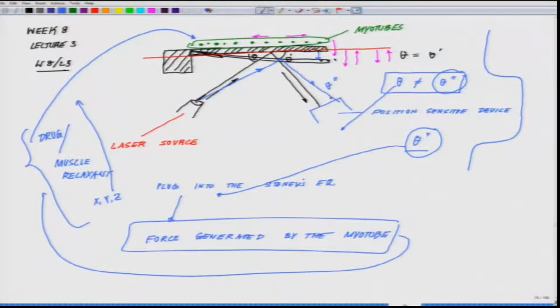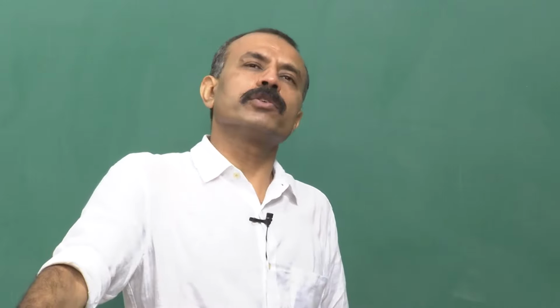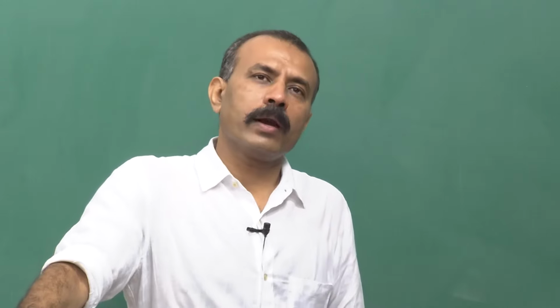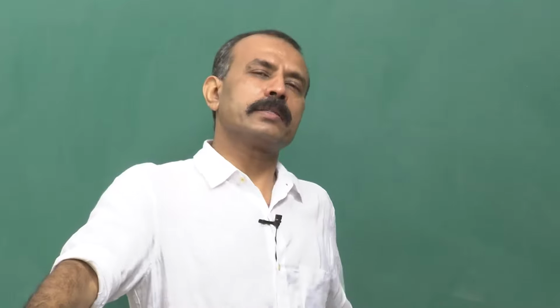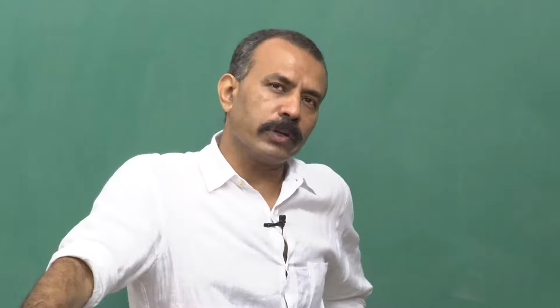So, this is one of the cleanest systems we had the privilege of developing, where we really could show how technology can change the future of in vitro systems, where a micro machine device is being used to measure the contractile force generated by the muscle.